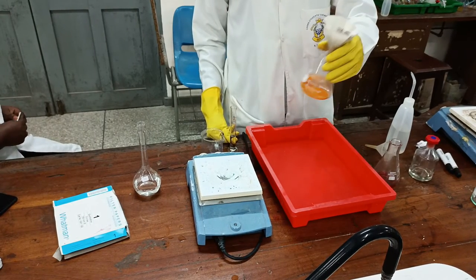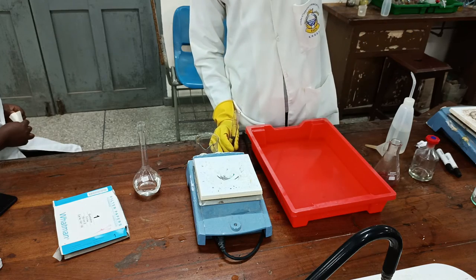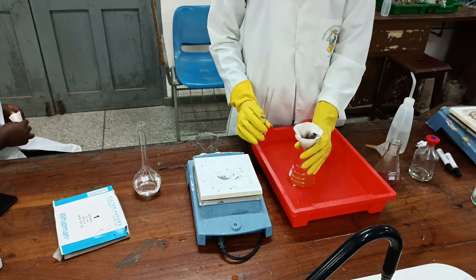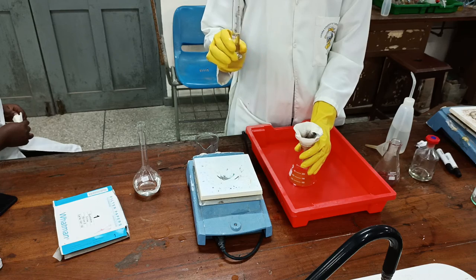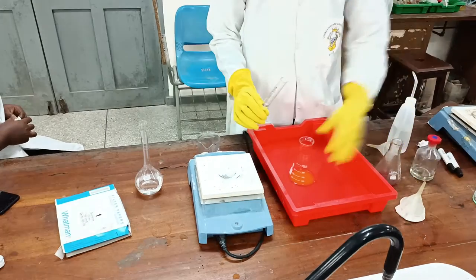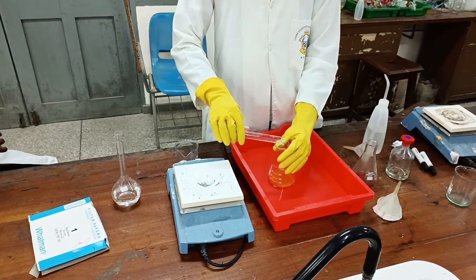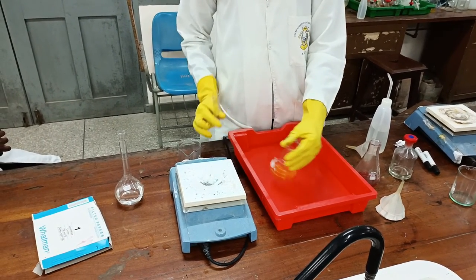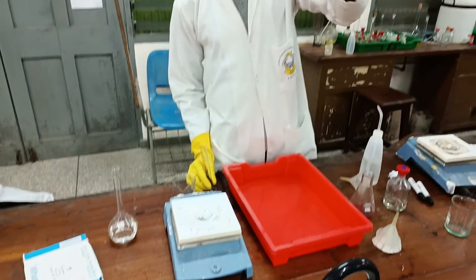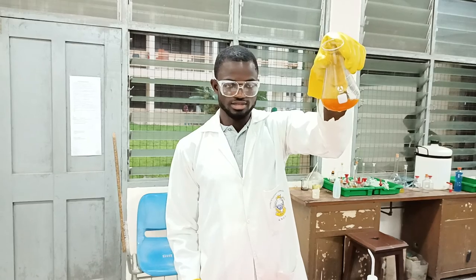Alright, as you can see, the crystals have started forming. So what you do is measure about 15 mL of conc HCl, then pour it into your mixture. As you can see, more crystals are appearing. Then you filter, then dry.